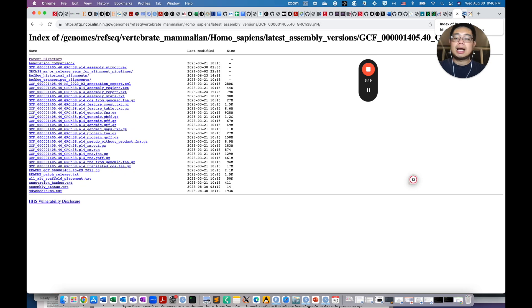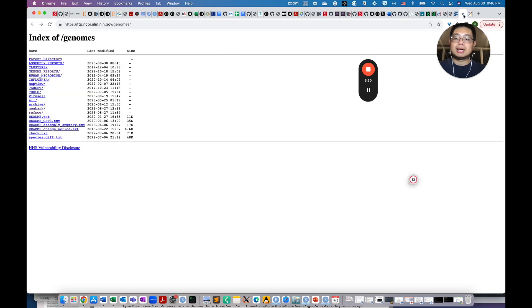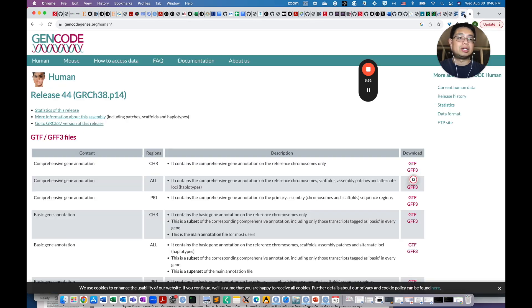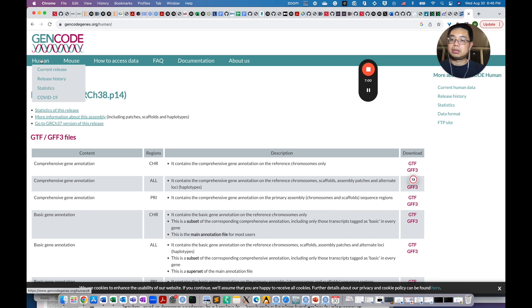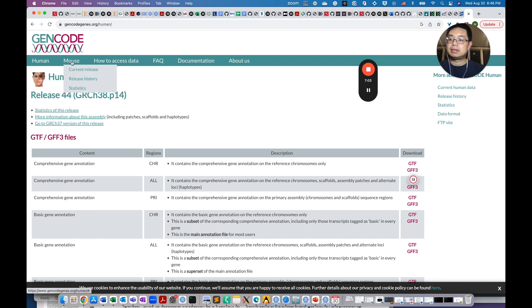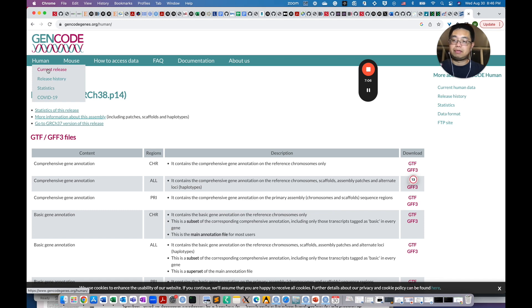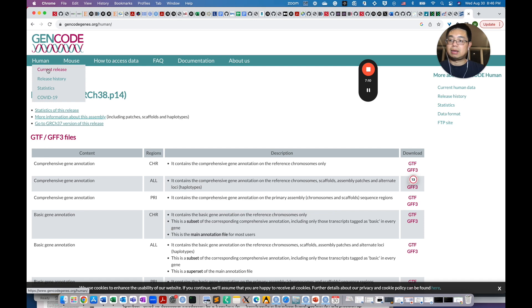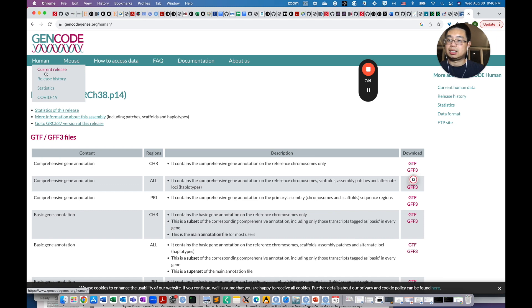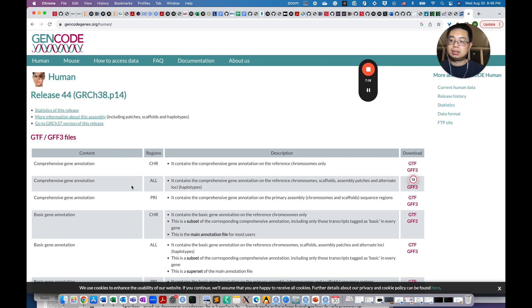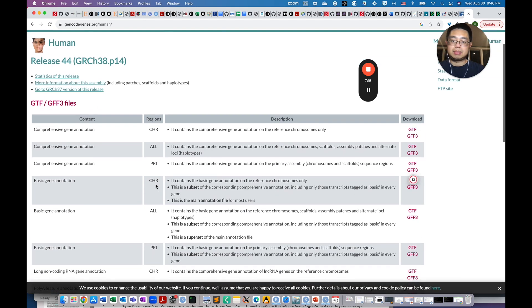And the last place that you can get those reference files is called GENCODE. You can just Google GENCODE and reference download. If you come here, it also has the mouse and the human. And also remember, for different reference files, it comes with different versions. Current release, for example. So we click here.